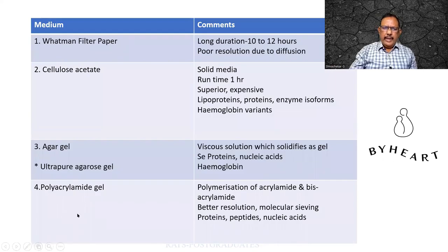Now, what are the media? One is the Whatman's filter paper. So hope you people are at least seeing it nowadays. Today we are engrossed in the so-called immunohistochemistry, and all the more you people will have to learn by heart this table. There is the Whatman's filter paper. It takes a long duration and has poor resolution.